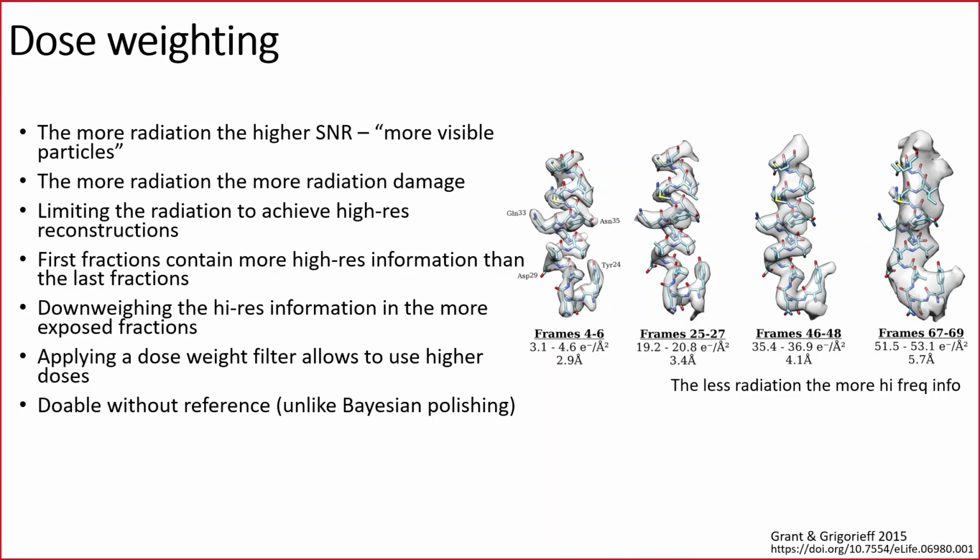Now, another advantage of the dose fractionation, or the fractionated movies, is that actually we can say what was the irradiation of the sample in a certain fraction that we acquired. Here was a very nice paper about how this dose weighting was invented.